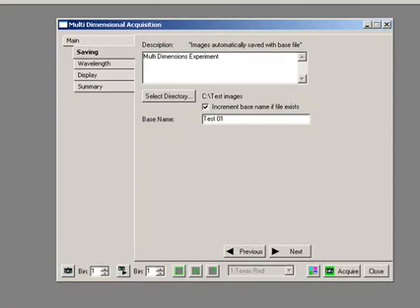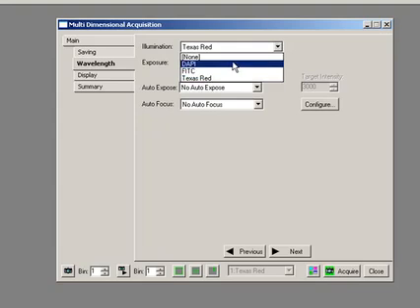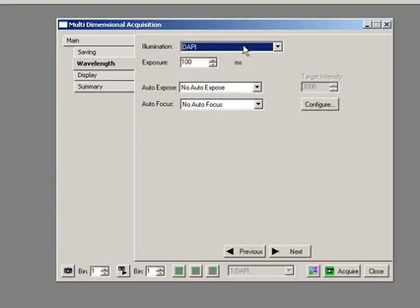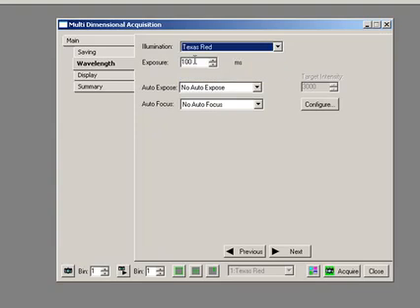Now what we're going to do is look at how to control the camera. This is all done at the Wavelength tab. Here I can control the actual illumination. So I had set up previously some illumination settings, so I've got DAPI, FITC, and Texas Red.